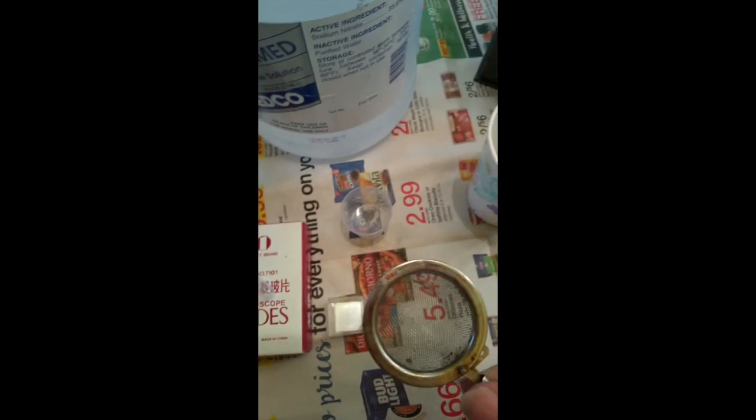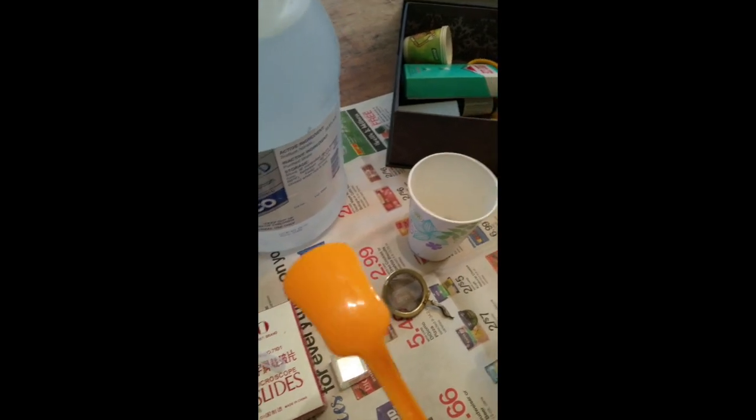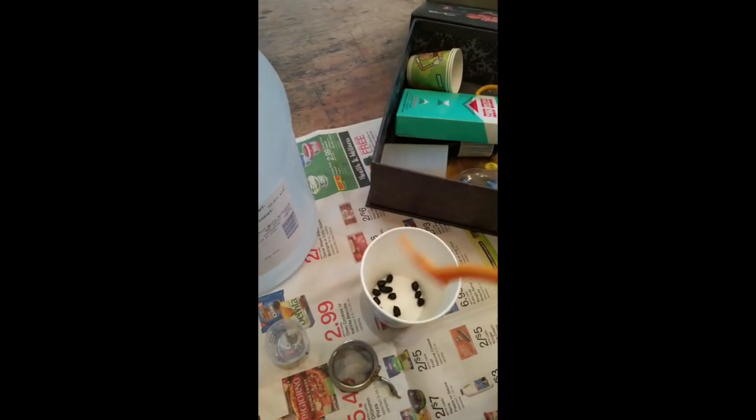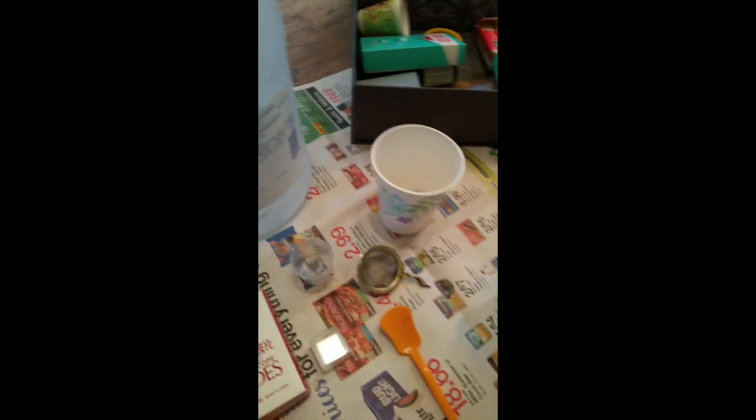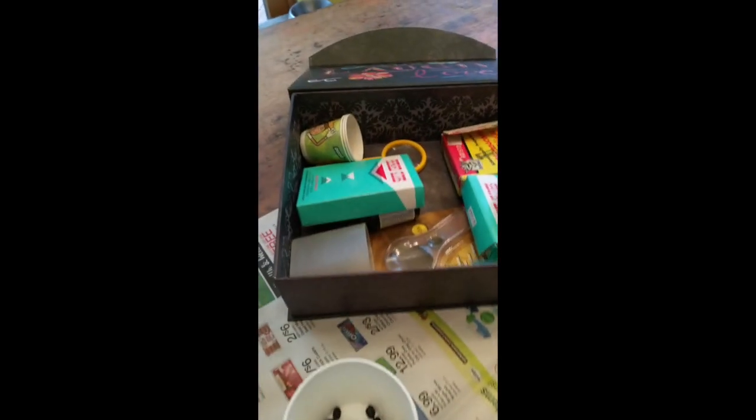You'll also need a microscope slide and a cover slip. If you don't drink tea regularly, this is what you can use your strainer for. And after you've had your frozen yogurt, you can keep the spoon and use it to smush little goat berries. I'm going to start on a 4x lens, then work up to 10x.